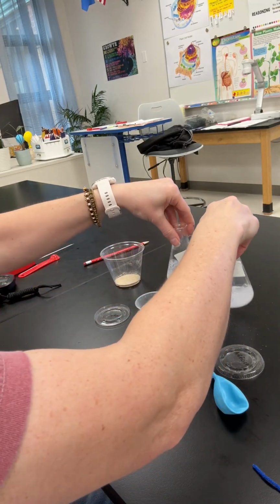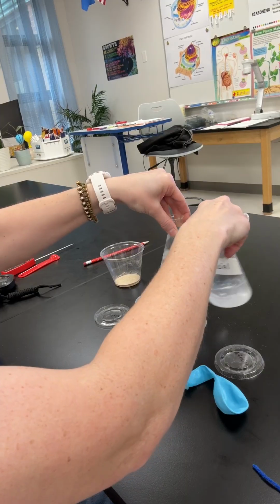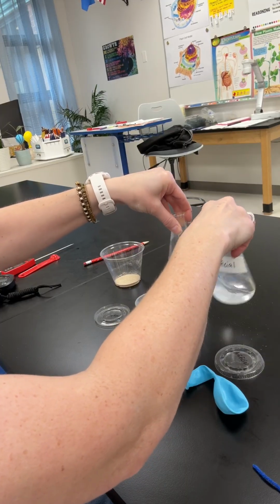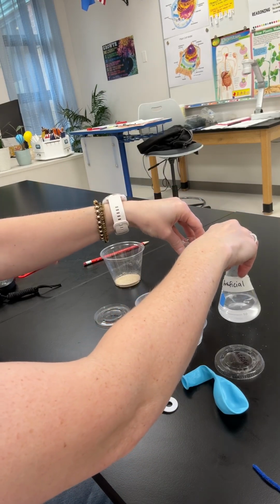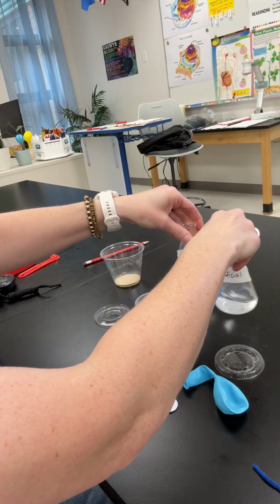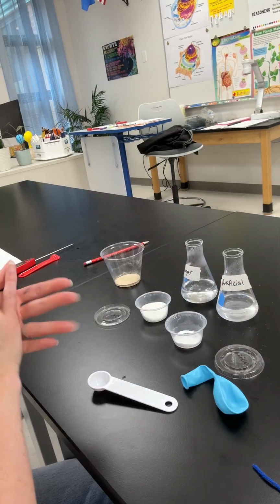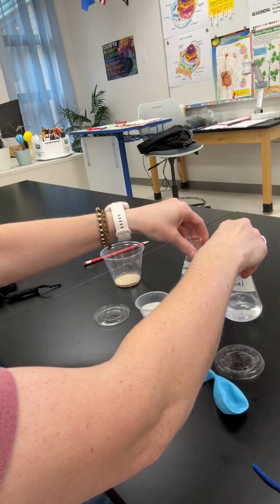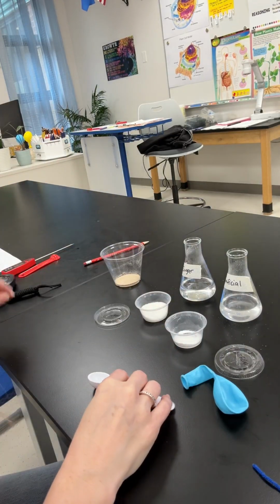Just like we use glucose or a sugar for our fuel for cellular respiration, the yeast do as well. But we're going to see, can they use artificial sweetener in lieu of a glucose or sucrose sugar? So now I'm going to add in my yeast.